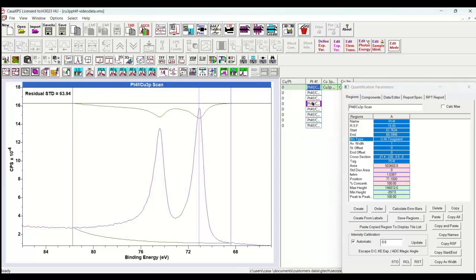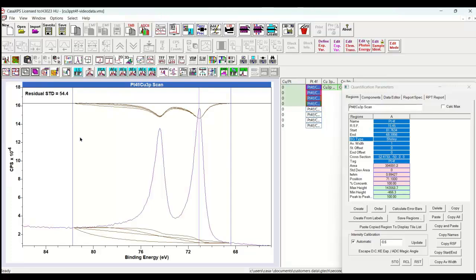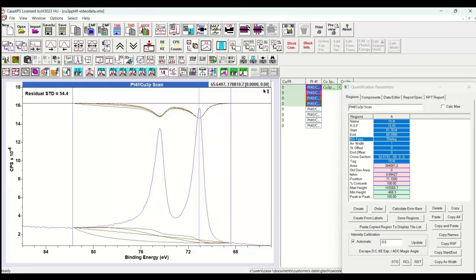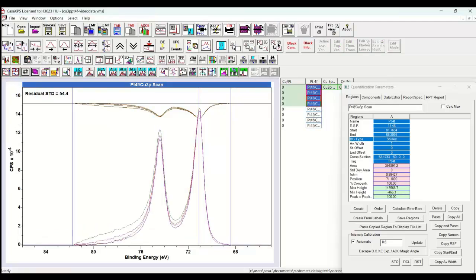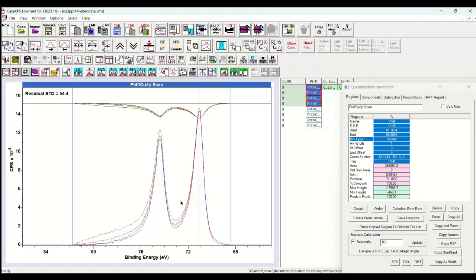I overlay these four that I've defined. And you can certainly see the backgrounds are different. And I can also graphically subtract the background signal from the data. And we can see that the worst one is this last one, which was the aluminum. That's not surprising because this is not aluminum. It doesn't have the resonances of aluminum backgrounds. So what we see here is a rather poor approximation. But all three are different for the three backgrounds that I've chosen. So the message to take from this is that the background that we introduce, we choose a Shirley or a Linear or a Tougaard, we are altering the shape of the peaks.